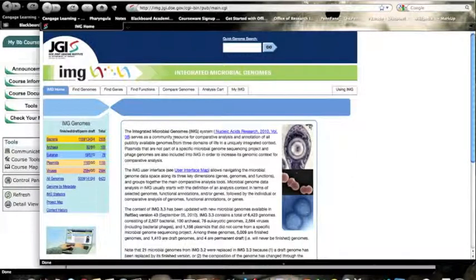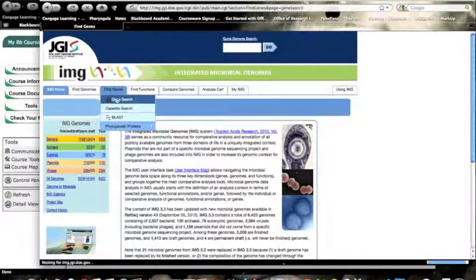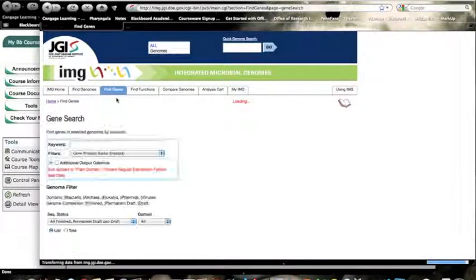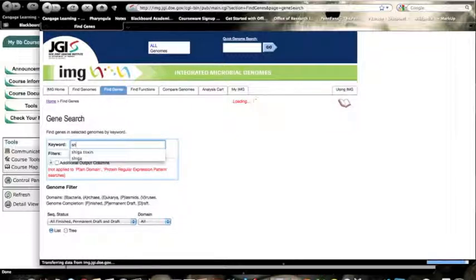And with your Google search, you would have figured out the pathogenic strain, the name of the strain, as well as the name of the toxin. So let's look for that gene in the pathogenic form of E. coli. And you would have found through your Google search it was Shiga toxin.